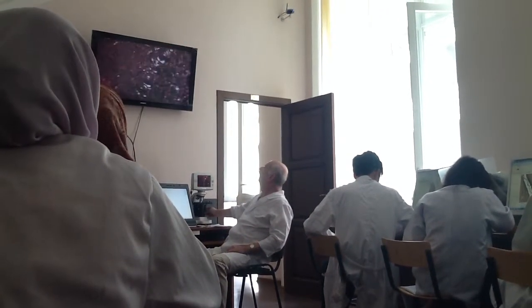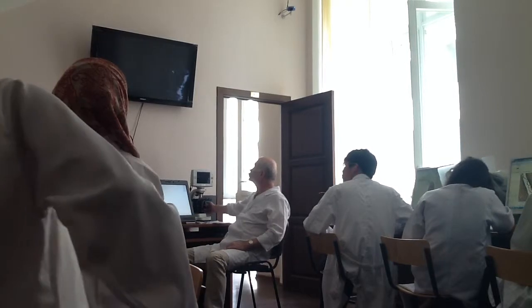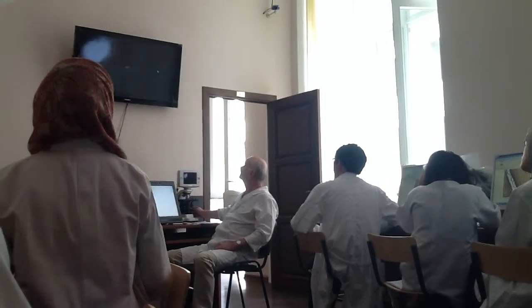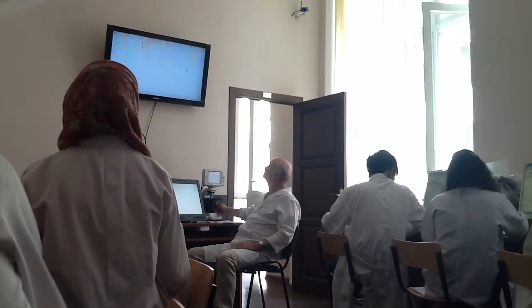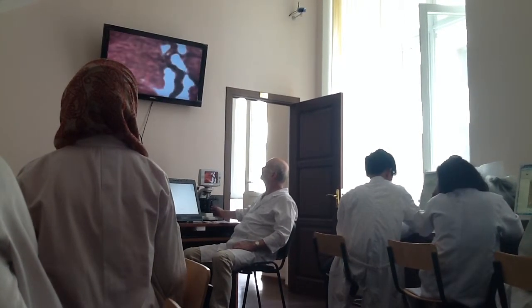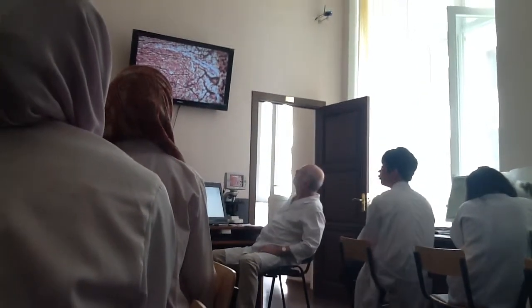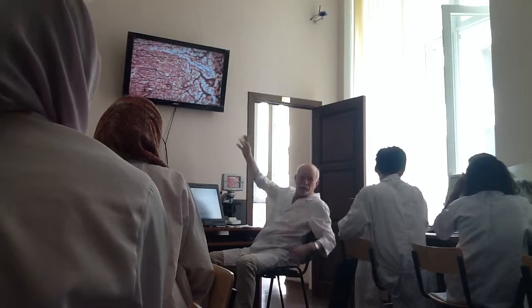Wait, I'll correct the illumination. What is this? I don't like it. No, the tissue is slightly detached, destroyed during fixation, yeah?